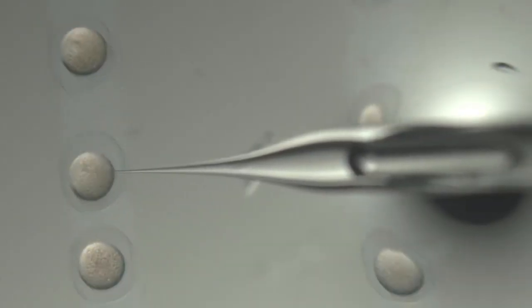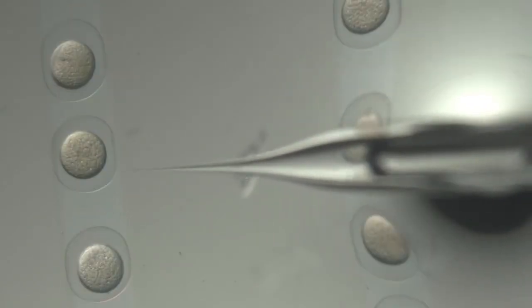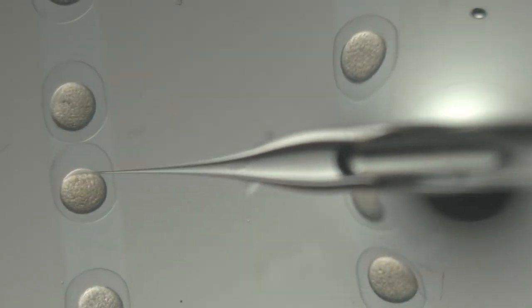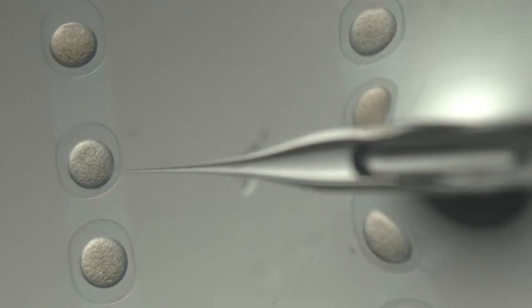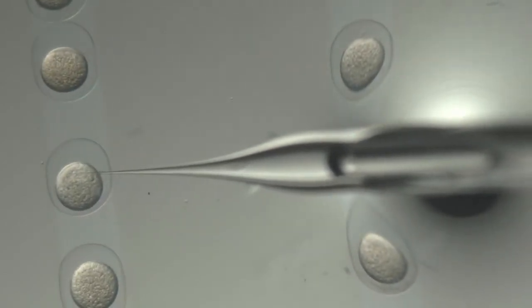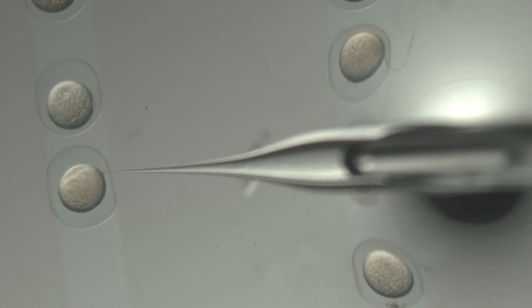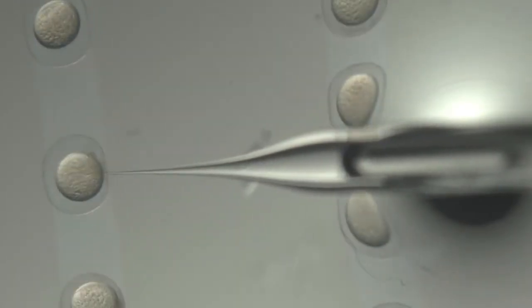In order to allow ubiquitous and homogeneous expression of H2B-mCherry fusion protein in all cells of the embryo, microinjection is performed at the one-cell stage. The cell division appears 20 minutes after fertilization, thus all embryos must be injected in less than 20 minutes.